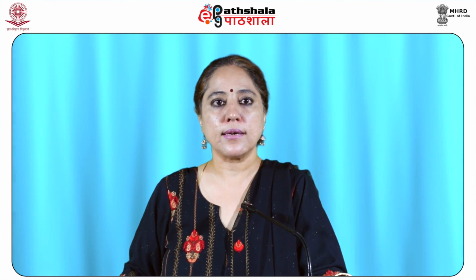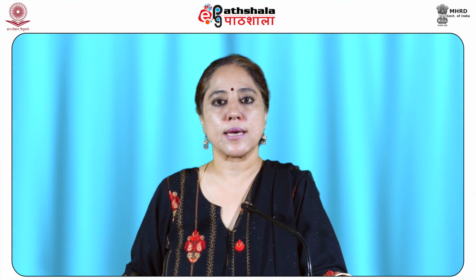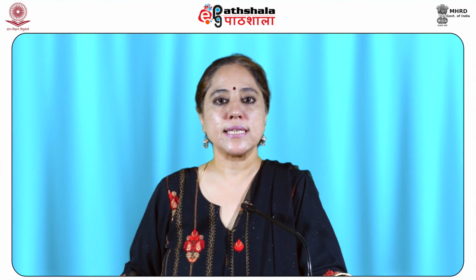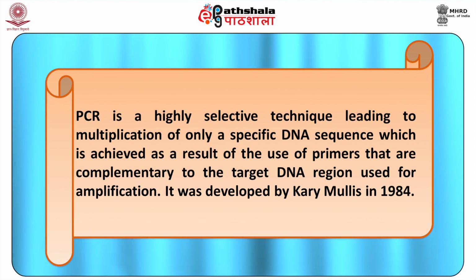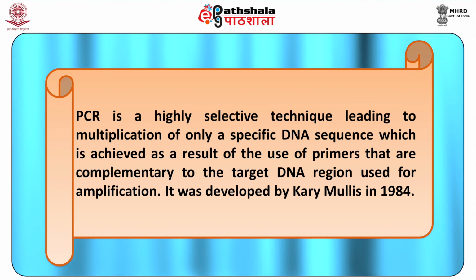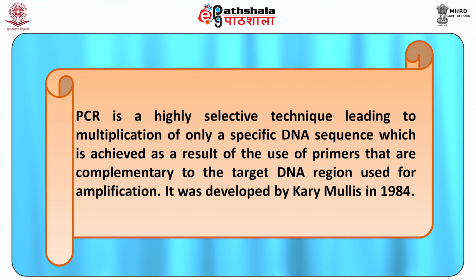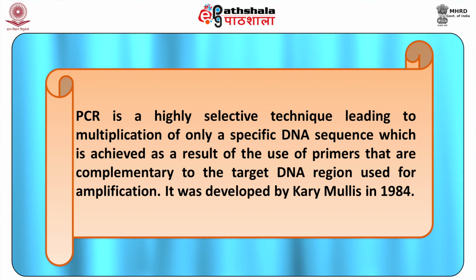Following the melting, the temperature is decreased and then each strand acts as a template strand for the synthesis of a new DNA via the DNA polymerase enzyme that selectively amplifies the template DNA strand. PCR is a highly selective technique leading to multiplication of only a specific DNA sequence, which is achieved as a result of the use of primers that are complementary to the target DNA region used for amplification.